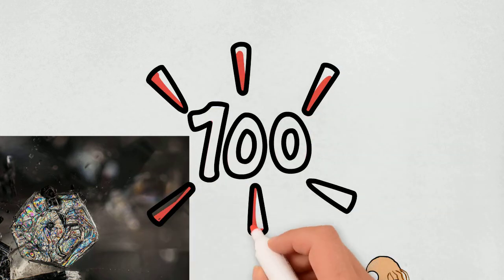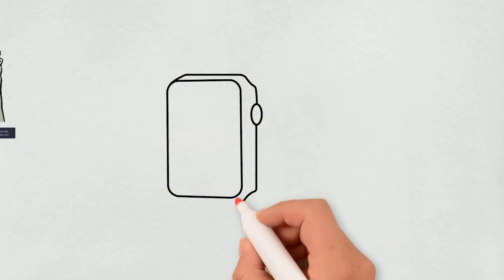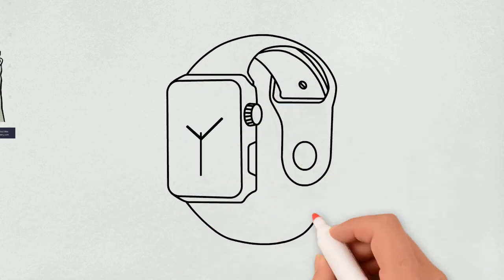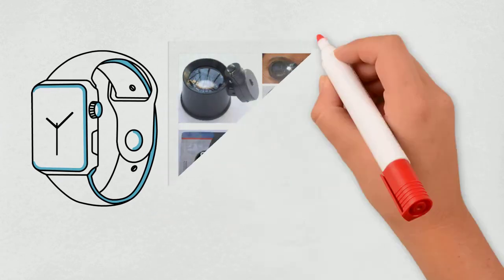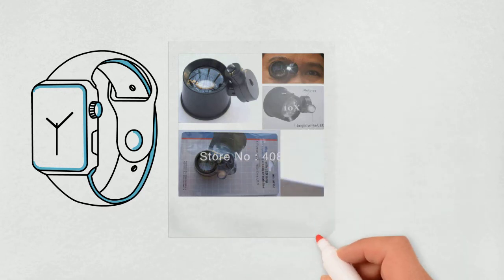LCD digital microscopes have the advantages of 3D visual aid, come with USB cords to save and transfer images, and are lightweight with a colored LCD screen, perfect for gemology fields. There is a latest technology called the 3D digital microscope that observes the watch from different perspectives.